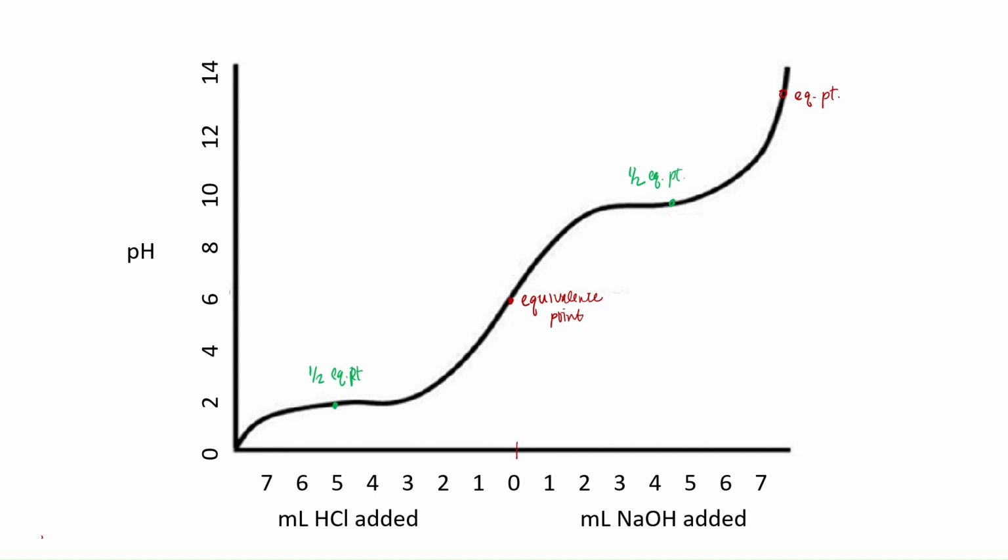And this is also known as the pKa, which you should hopefully remember from when we talked about pKa's in Chapter 2. So the pKa is that midpoint where you have a mixture of the two species, and that's halfway between the equivalence points. So when you measure the volume of titrant that you add and the pH, you can draw a graph like this, and that will help you determine the equivalence points and the pKa's.